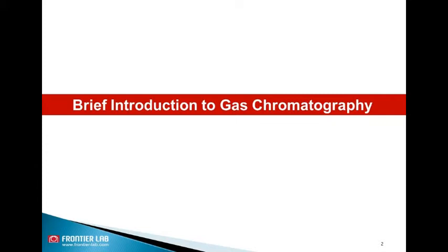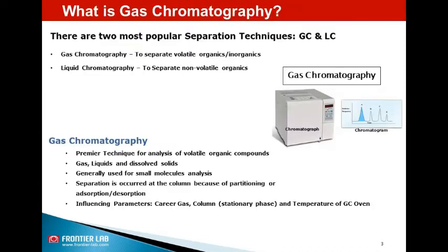In today's video, we will be introducing gas chromatography working principle briefly. As you all know, there are two most popular separation techniques that are available in the market. One is gas chromatography, the other one is liquid chromatography.